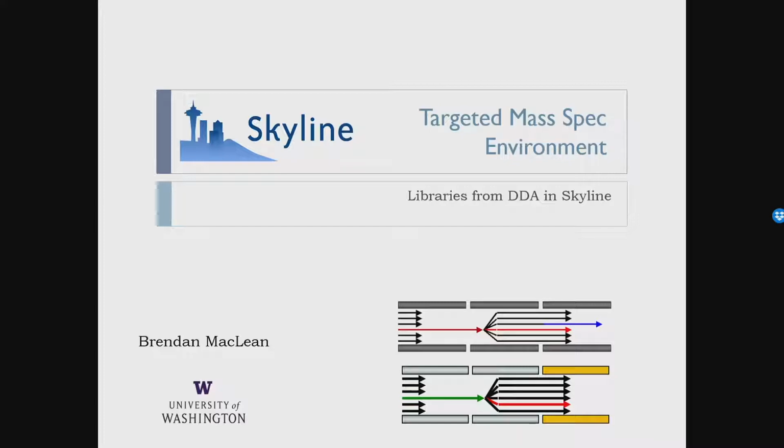So yeah, a lot of what you're going to learn here, you could do all in Skyline, and certainly you could supplement anything you're doing with Skyline. And so today, you've built a library, right? You've done a peptide search in Comet, and then you built a library out of that with Spectrast, and then you built a set of peptide query parameters for DIA out of that, right?